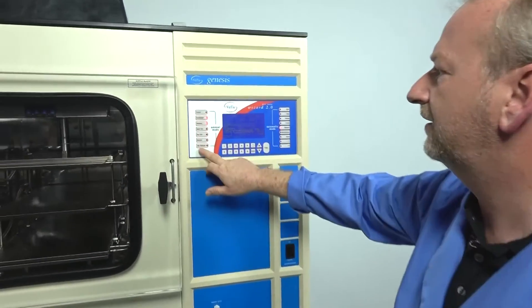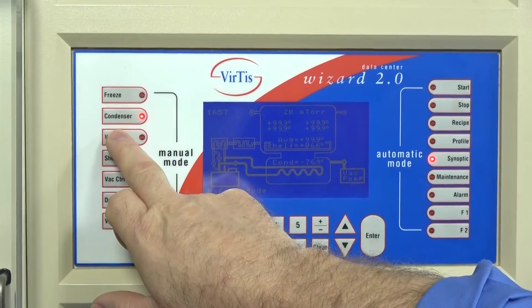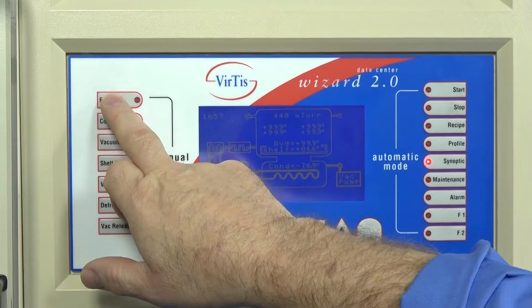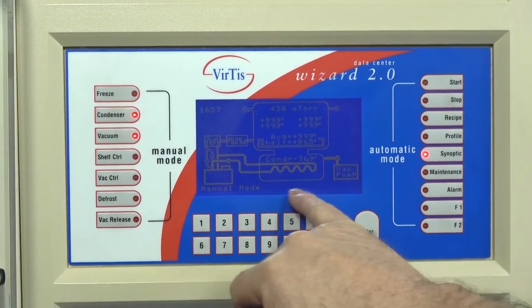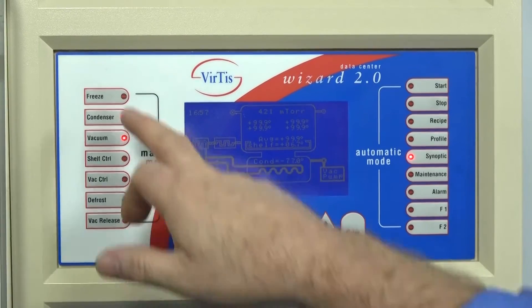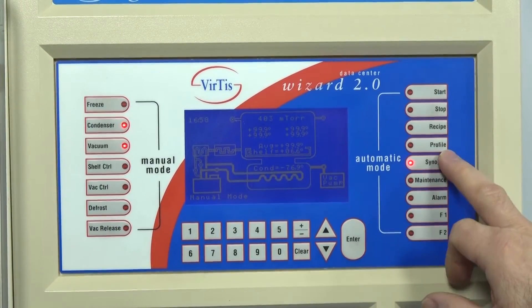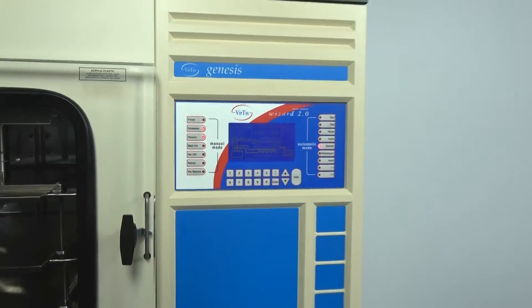Right now I'm operating it in manual mode, which uses all these buttons here. You can turn the vacuum on and off, turn the condenser off and on, or turn both off. You can turn the freeze on, which activates your shelf freezers, and set the actual temperature even in manual mode. But ideally, once you figure everything out, it's nice to use the recipe — it's plug and play. Put your product in, come back, and it's done.